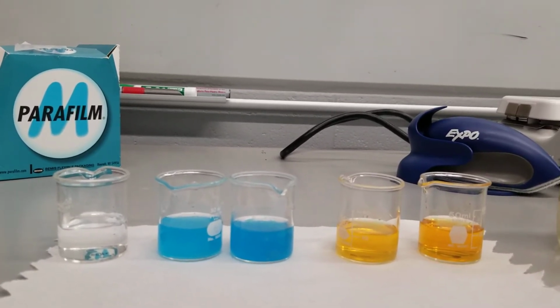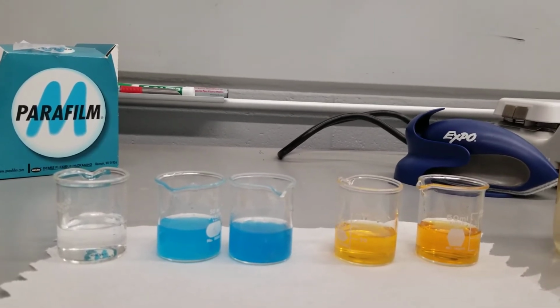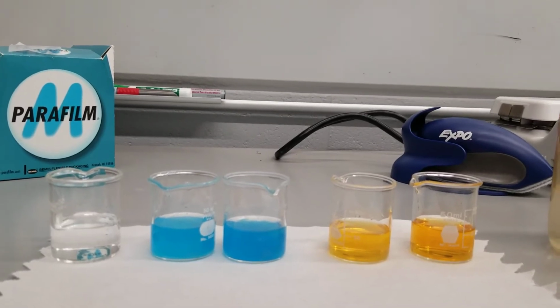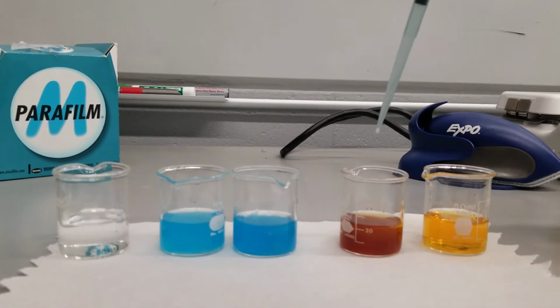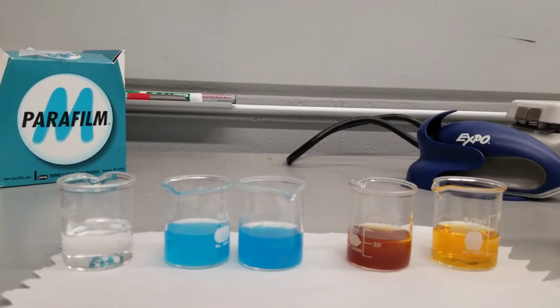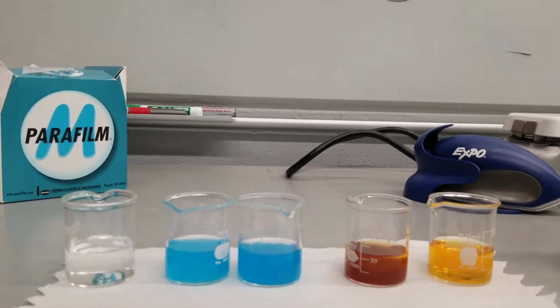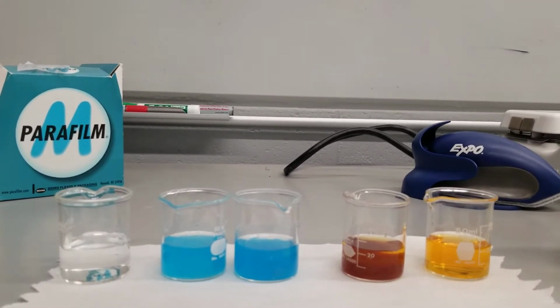And then we have two other ones that have a sort of reddish color to them. That could be the presence of heavy metal. That could be just mud as well. So it's not always that color indicates there's something there. But we have to put it to the test to see, and clearly you see a deeper color. The important thing is the so-called PPT, precipitates in chemistry. It's not just color. You form precipitates with sodium hydroxide when you have heavy metals in water. And you can see clearly that indicates there's heavy metal there.